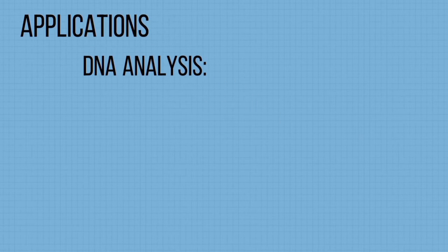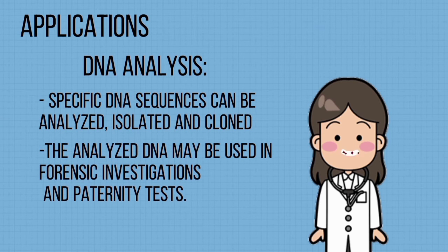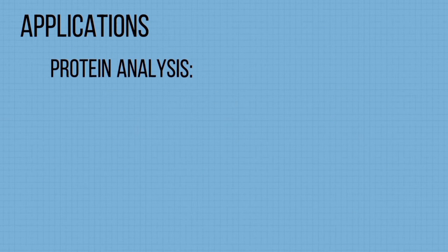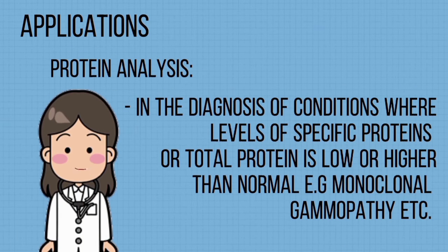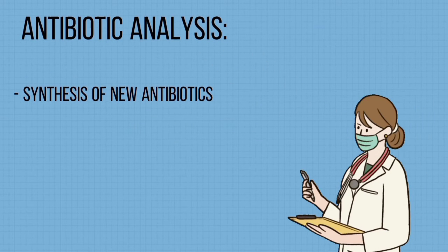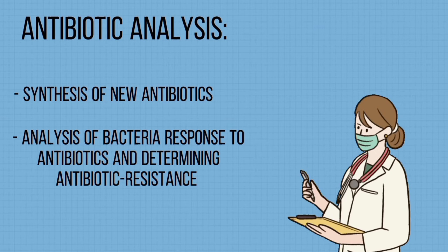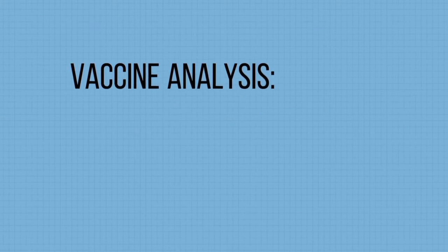Applications: DNA analysis, protein analysis, antibiotic analysis, vaccine analysis.